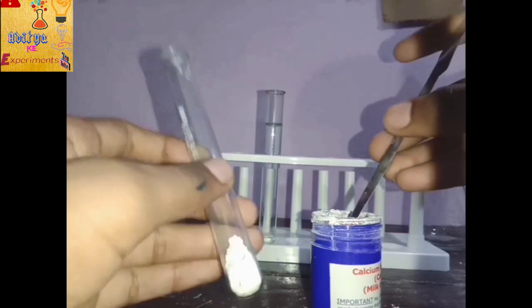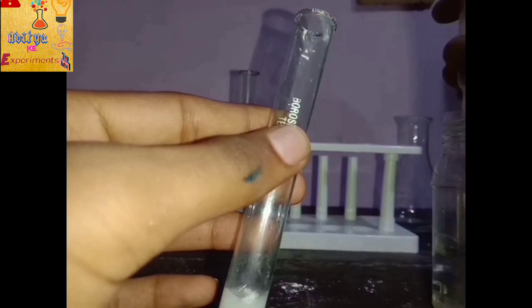Now take some calcium hydroxide in the test tube. Actually, calcium hydroxide is a base and it's insoluble in water, so you can only mix it, not very well. It's enough. Now I'm adding some water to make it a solution.